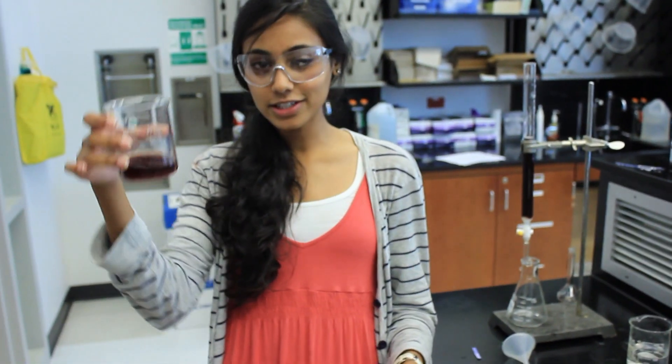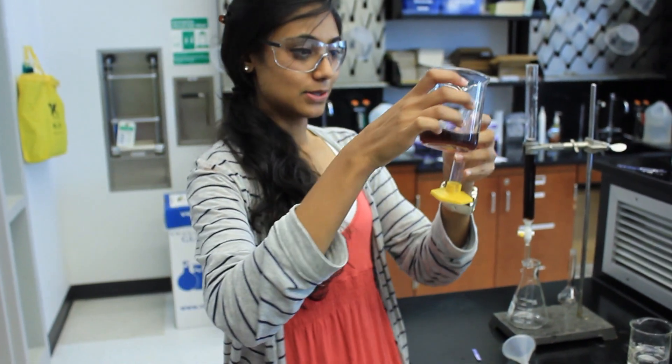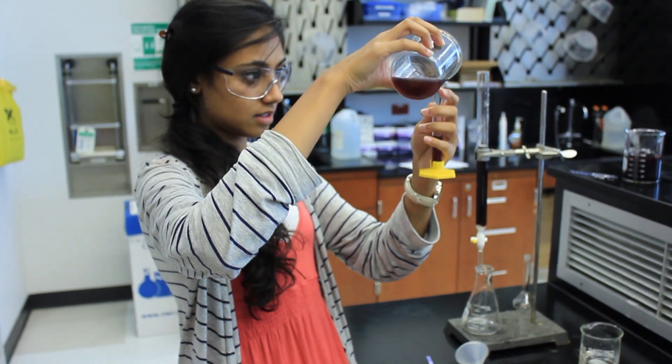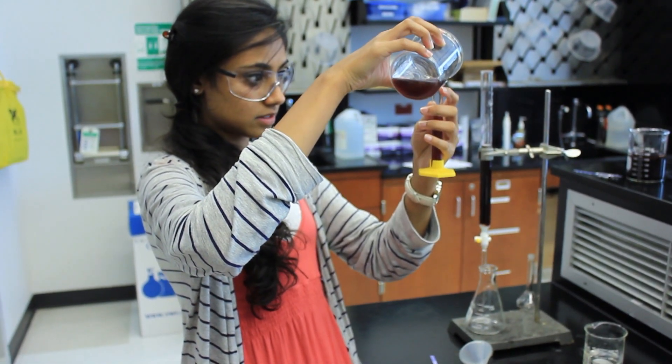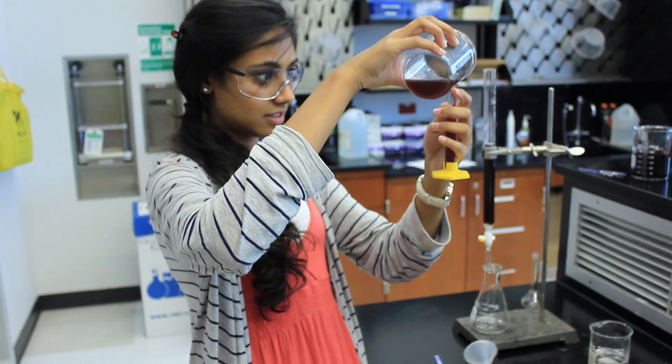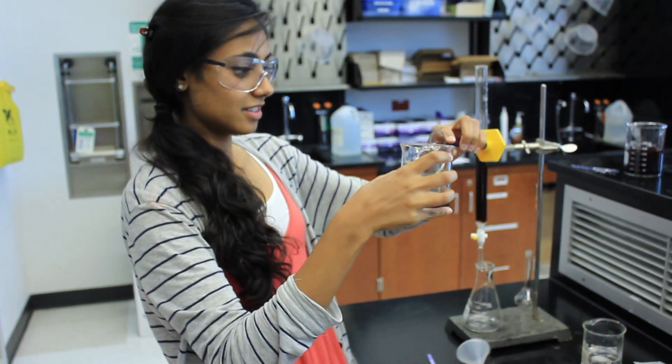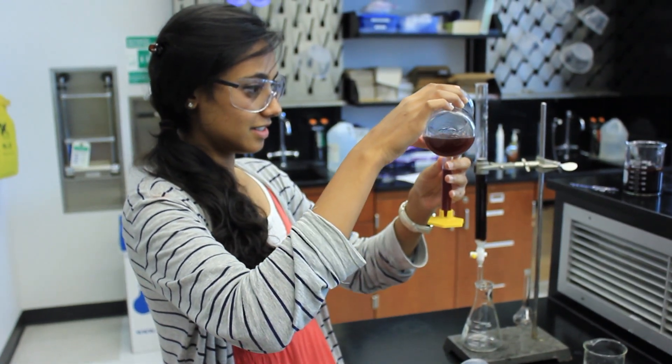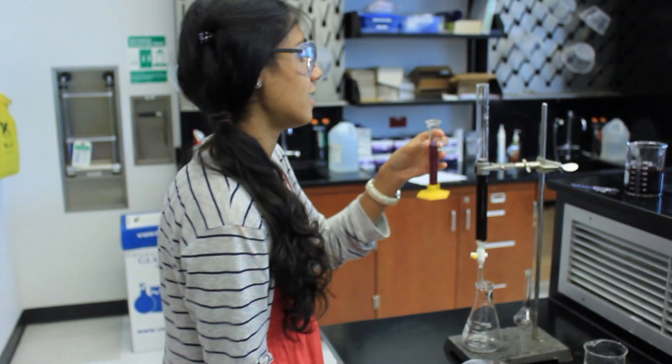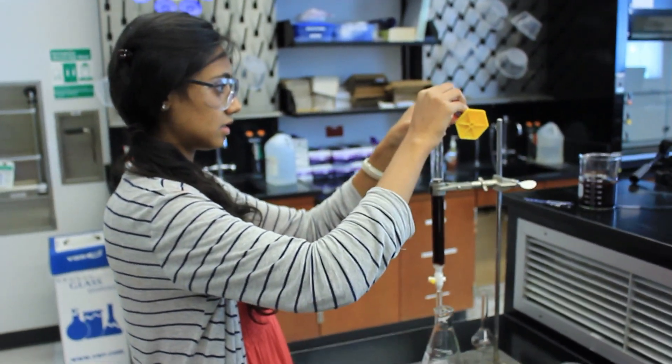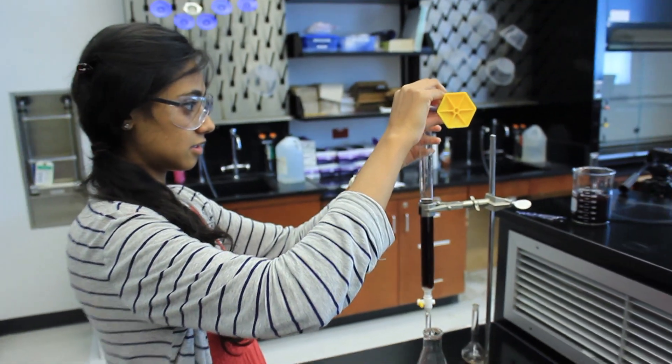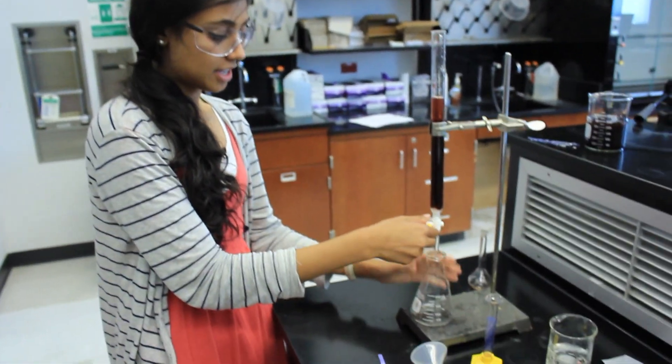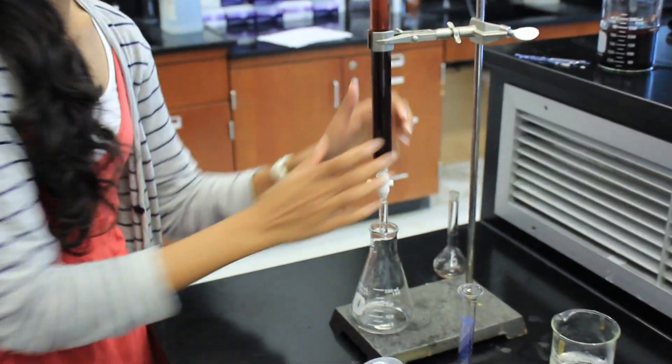Now we're going to take 10 milliliters of our reduced green crystal solution and put it into our graduated cylinder. You're just going to pour it right on top of your column. And you're going to let this flow through until your solution is neutral.